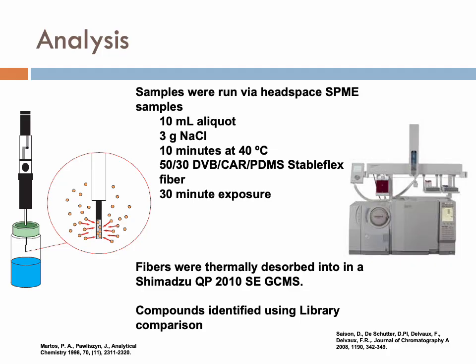We're going to focus now on just the volatile, semi-volatile space using this GCMS. So we have our GCMS system using something called headspace SPME. You can see on the left side of the slide, we have a fiber that's inside of a needle. So we can expose that fiber to the headspace, the gas above our solution, our beer. Compounds will preferentially stick to that fiber over time. We can then take that fiber, put it back in the needle, transfer it into our GCMS, and heat it up. Those compounds will come back off.